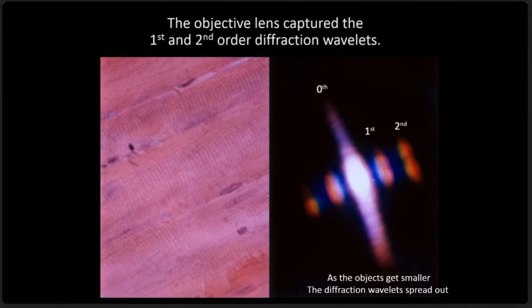Well, if you take the eyepiece, if you're looking at this in your microscope, and you remove the eyepiece out of the right-hand side of your viewing head, this is what you're going to see. You see a diffraction pattern. What happens is, and this was shown by Ernst Abbe 130 years ago, that the specimen produces a diffraction pattern at the pupil inside of the objective lens. So here you can see there's the 0 order of the diffraction pattern. There's the first order and there's the second order. There's the first order on the other side and the second order on the other side.